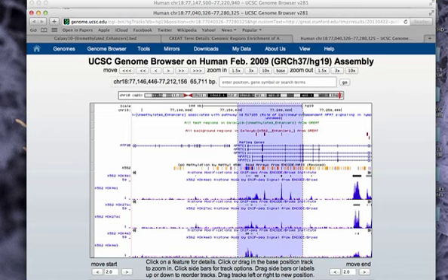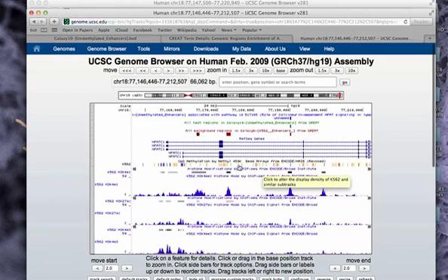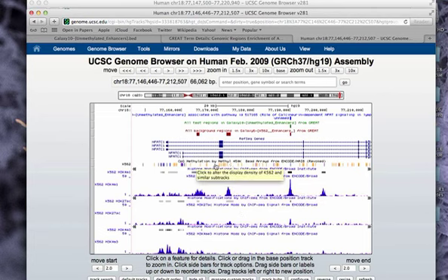And if we zoom in, what you can see here on the methylation data, where a more orange color denotes methylation and more blue is unmethylated, is that you have a number of regions here that are potentially methylated. The transcription start sites are unmethylated, and then this enhancer is as well. So that is the end of this tutorial. Have fun sifting through your own data, and we'll be looking forward to seeing you soon.